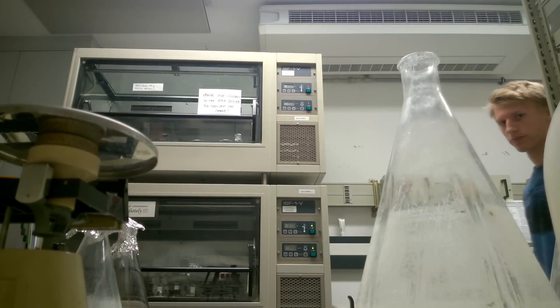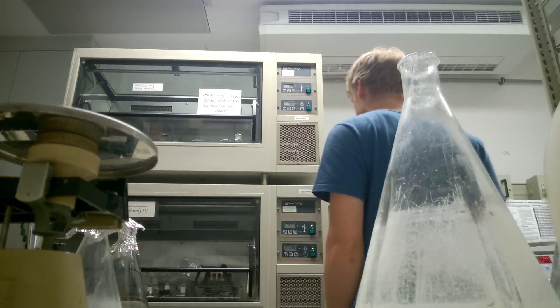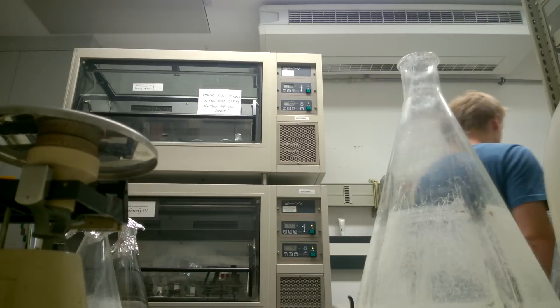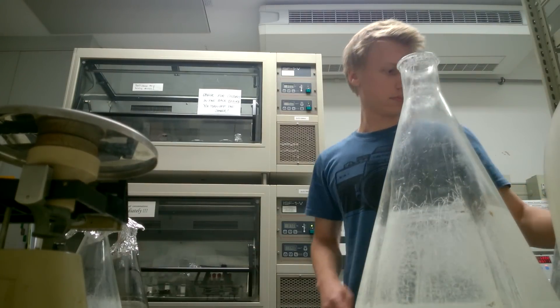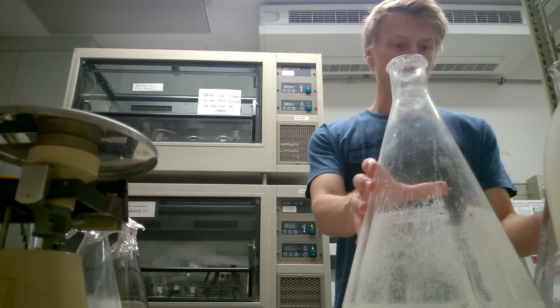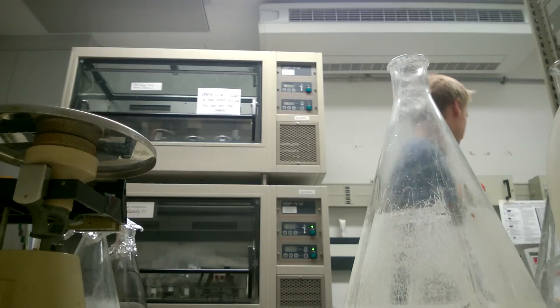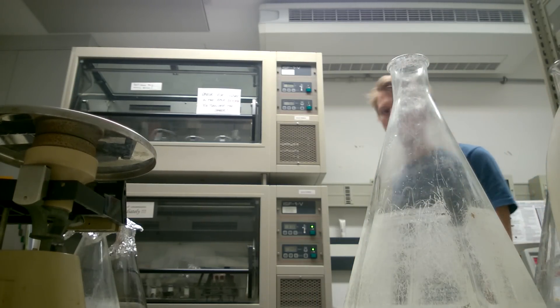Most of the harvesting is already done. Right now I'm actually waiting on the centrifuge to be done, and once the centrifuge is done I gotta be pretty fast and get the supernatant medium off the cell pellet — but you're going to see that in a second.